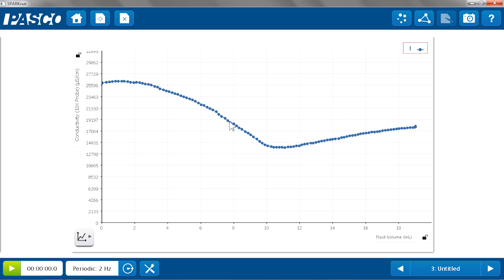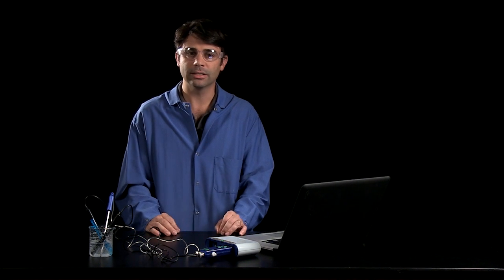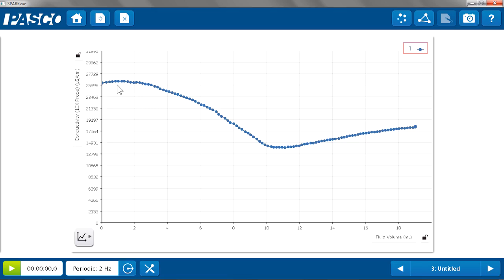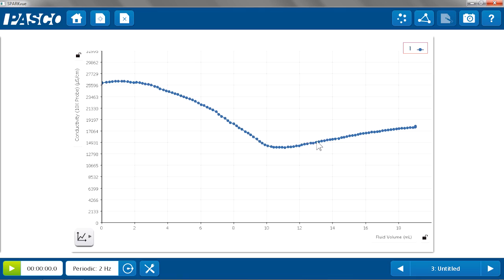This is the thing that you can't normally do. This is the sort of nice thing about the advanced chemistry sensor. Now I can tie in conductivity with pH and temperature. My conductivity started high, got lower as I was producing more and more water, until the equivalence point was reached. And then I went beyond the equivalence point, and I was just adding more of a strong electrolyte titrant in sodium hydroxide. My conductivity started to rise again.